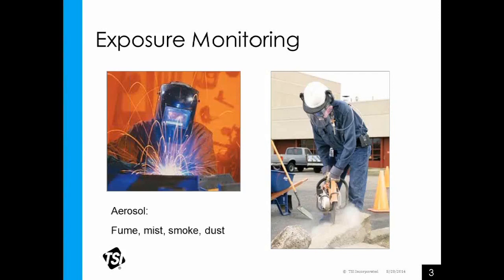Typical industrial hygiene is you're measuring this on a filter with a sample pump, and sending it into a lab for gravimetric analysis. And that's not going to go away. So what we're going to talk about today is how the photometric instrument can supplement this process and help with some additional data that can maybe make some decisions a little easier. The more data you have, the better decisions you can make for protecting worker health.